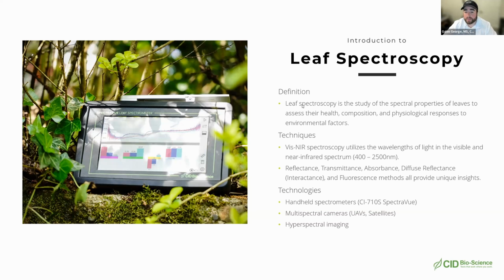The next question is, can we have a printout of the results directly by attaching a printer? That's a great question. I don't know off the top of my head, but it has Wi-Fi capability. So I'm assuming that we could come up with a solution if that was something you needed. We probably could find a way to directly transfer the data to some sort of API that would run that data through to your printer, if you have a wireless printer or a printer capable of interacting with Wi-Fi.